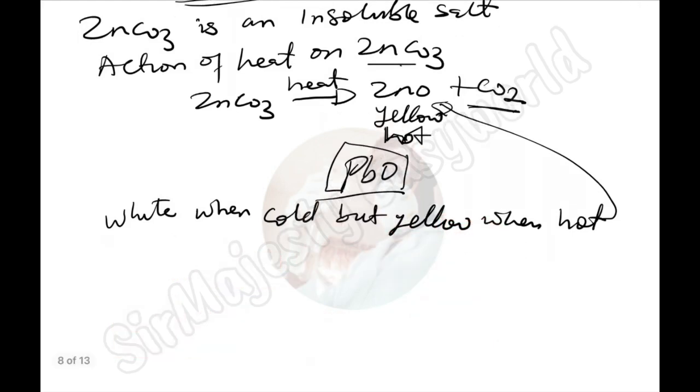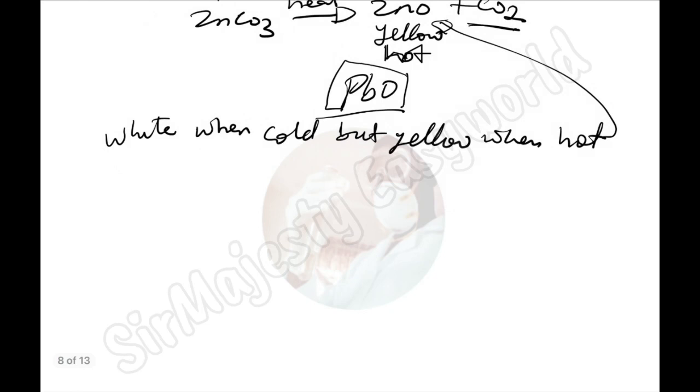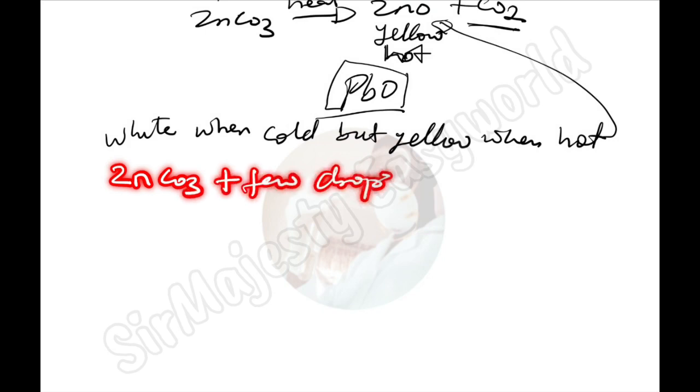The next thing is that you might be required to add a few drops of HCl to the zinc carbonate.